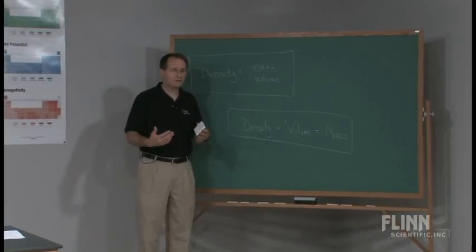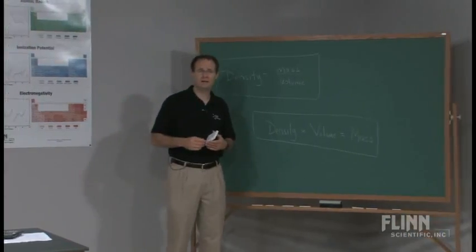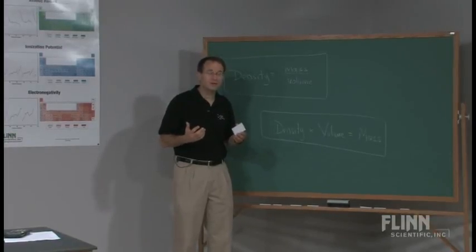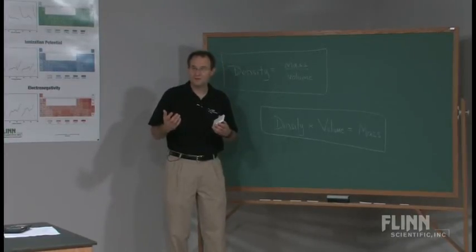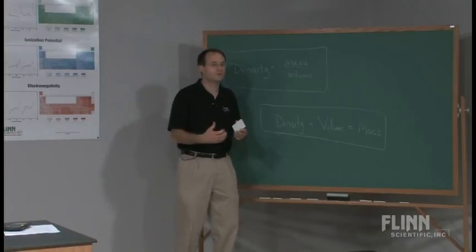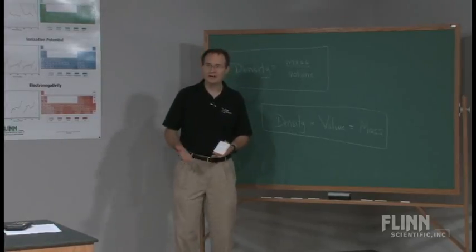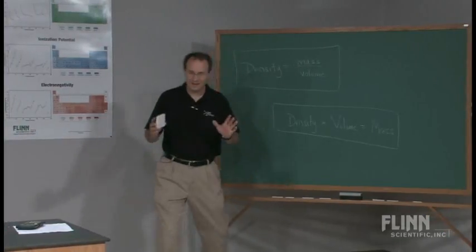So I don't have to watch them do their calculations, because I'll be the gatekeeper, so to speak, at the electronic balance. And what I love to say to the students, we're going to watch their grade happen in real time, that the balance isn't going to lie. And so if you've ever had the students say, I tried, I really tried, or I double-checked, I triple-checked, I'm glad you did. Now let's put it on the balance and watch what happens with your grade. Will your grade go up or will it go down? And it is great fun and lots of excitement here.